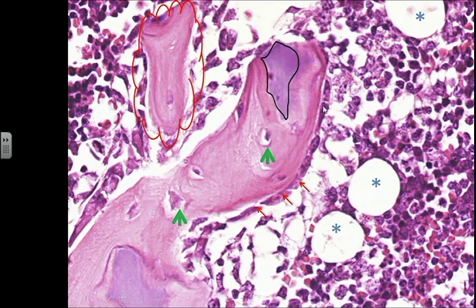So here is one cell, one cell, one cell, one cell, next to each other, but the thickness is just one cell, going hand in hand along the length of the bone spicule. These are osteoblasts, and they are the cells responsible for formation of collagen type 1. That's the organic component of the bone matrix, and we'll speak about them in detail in another video.